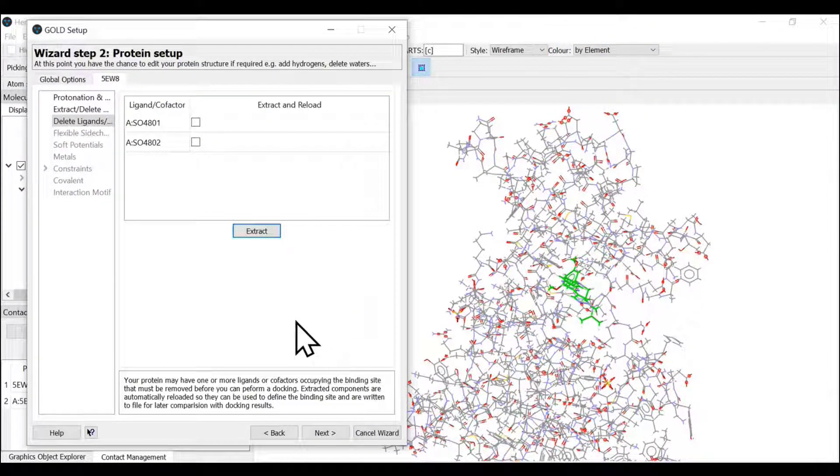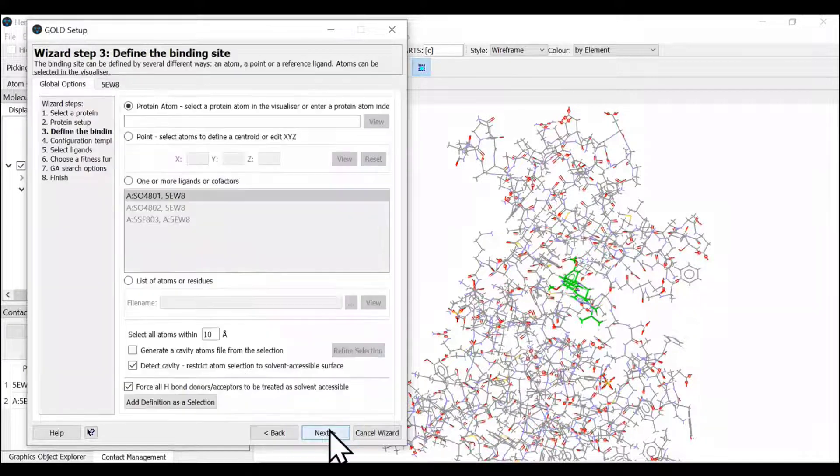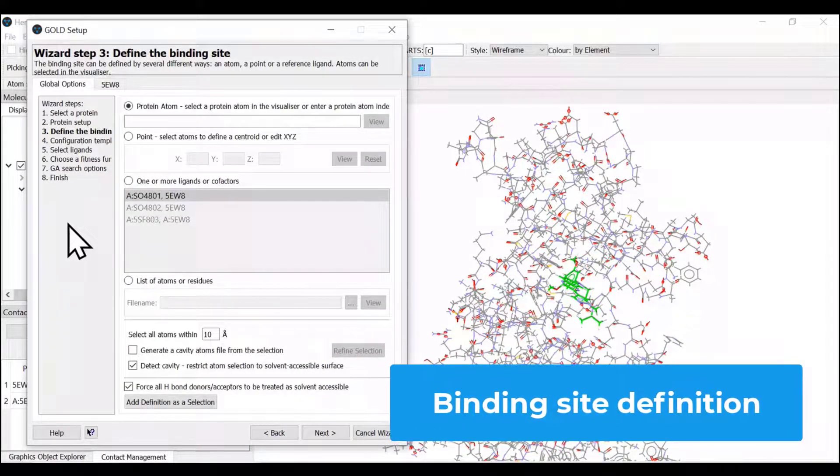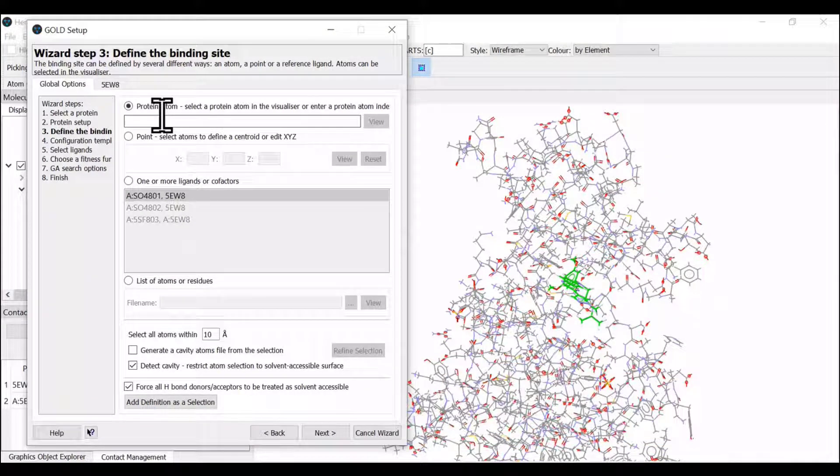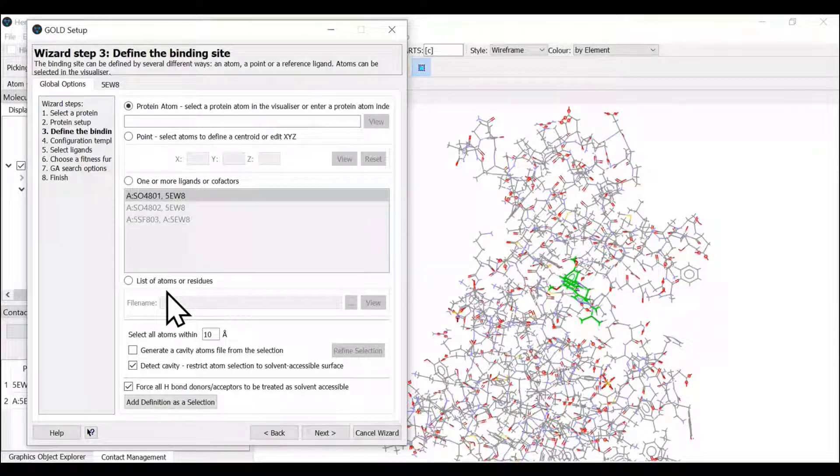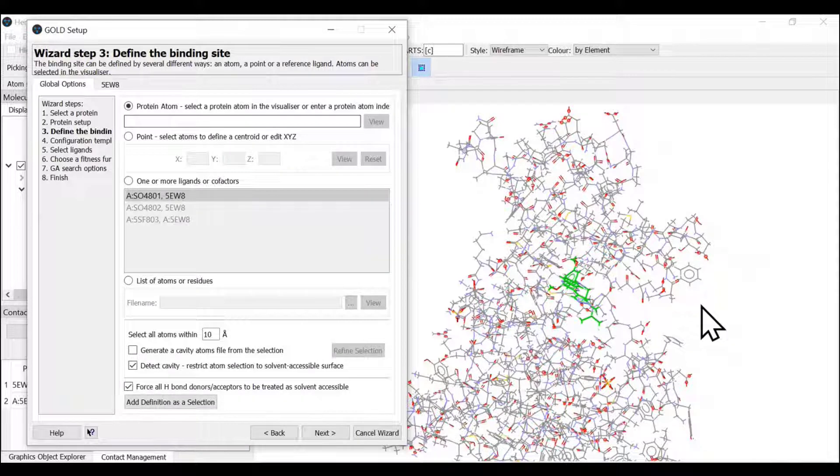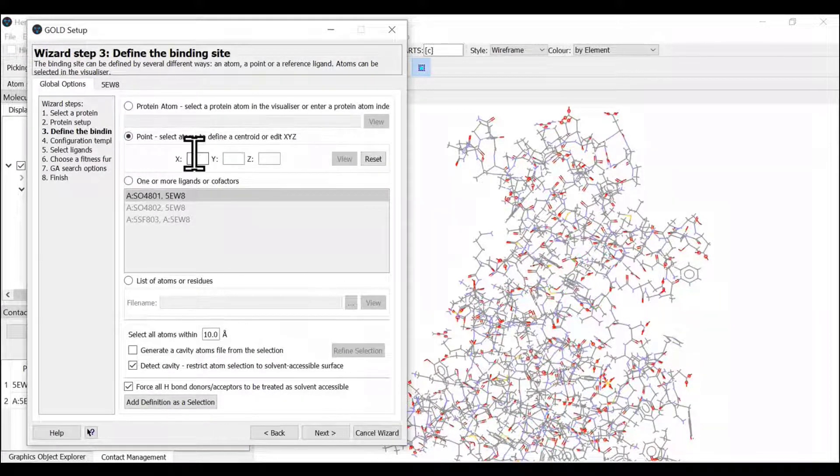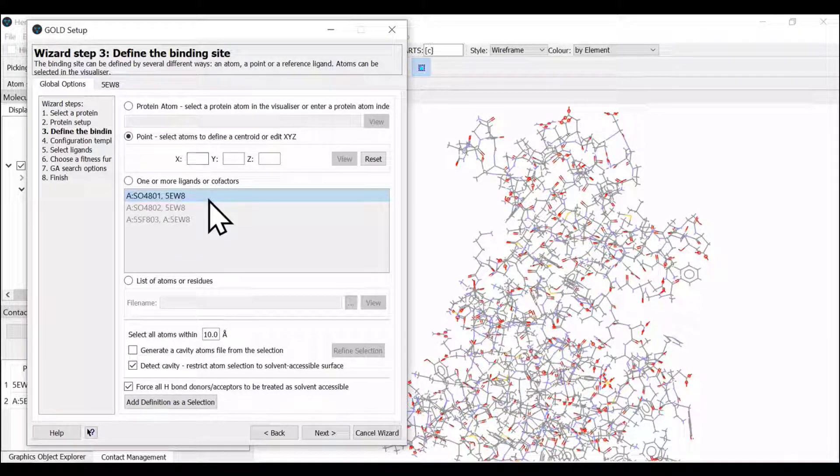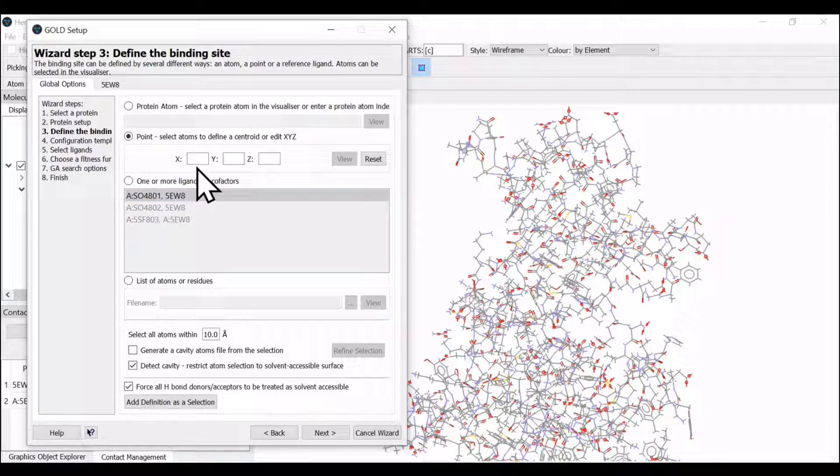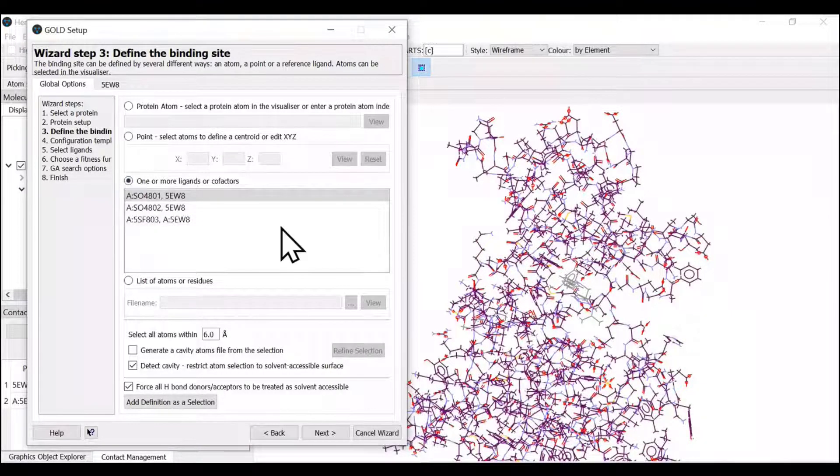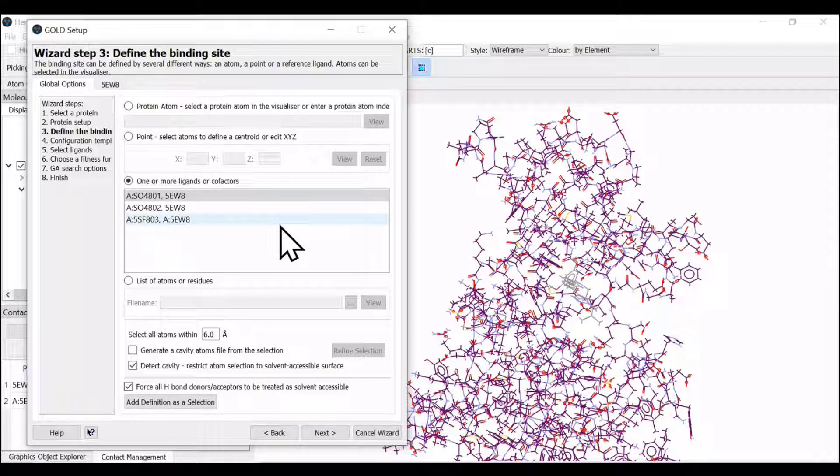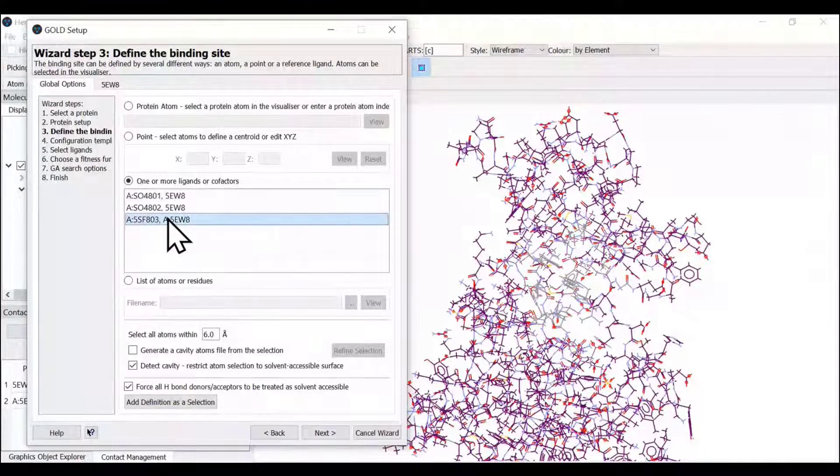Now let us move to the next step where we have to define the binding site in our receptor. There are four different options available in GOLD for defining the binding site. First, you can select protein items from the interface. Second, you can provide XYZ coordinates from the PDB file. Third is to suggest a reference ligand.